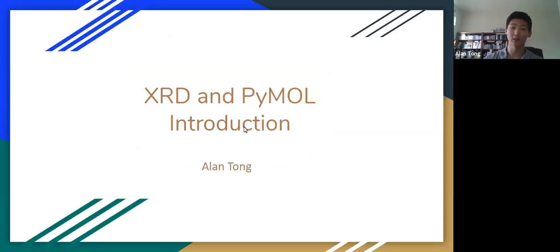So today we're going to be talking about something that you might have heard about a little bit, but hopefully this will give you some more insight. Today we're going to be talking about these two ideas: XRD, which is X-ray diffraction, and PyMOL. These two things go hand in hand. X-ray diffraction and PyMOL are tools that you can use to look at these protein structures.